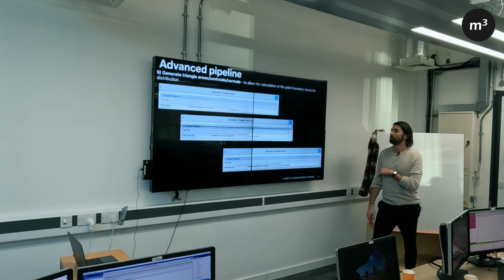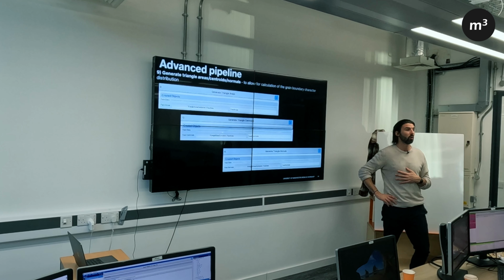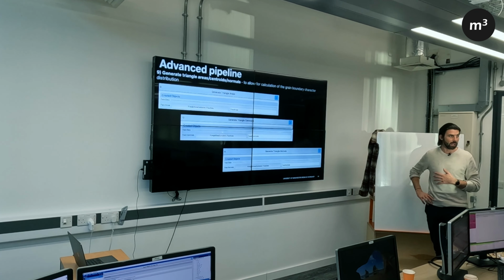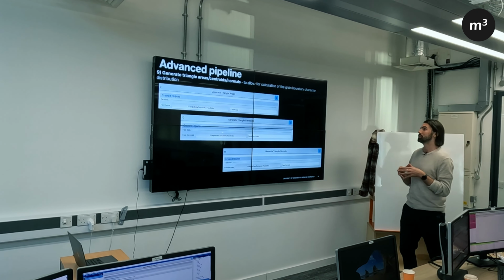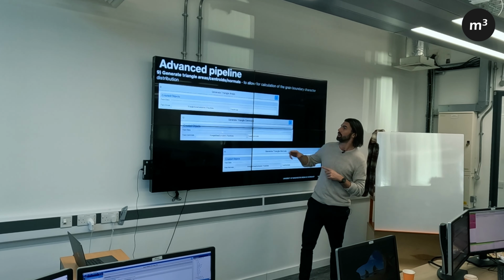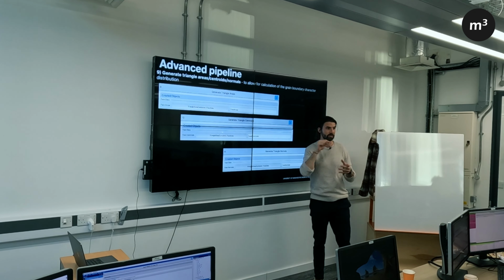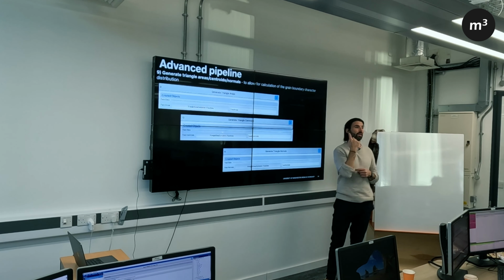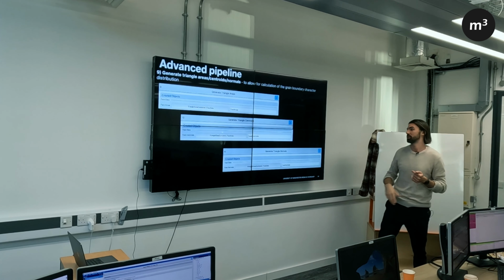This is probably not that relevant for today, but for future work, if we want to calculate properties of our grain boundary in terms of grain boundary plane and our 5-parameter grain boundary distribution, we want to generate some statistics on these triangles themselves. Here we can get the area of each face, the centroid, which is the central point of that face, and the normal of that face. The normal is very important for calculating the grain boundary plane, which really determines the grain boundary energy.